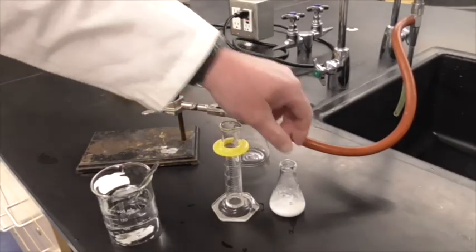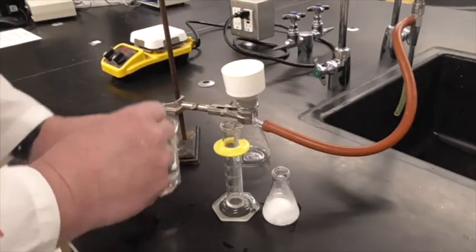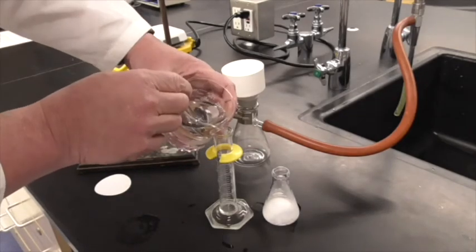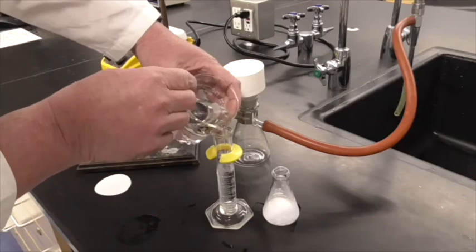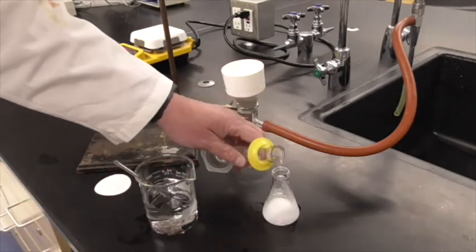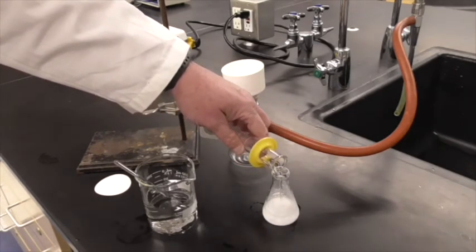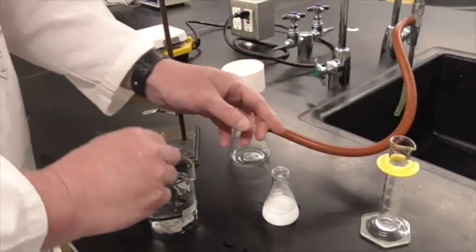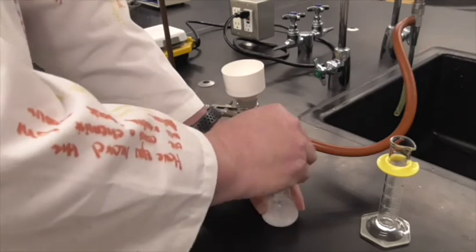Okay, so now we've got our aspirin, and it tells us to add 20 milliliters of water. I've chilled the water in the ice bath, so it's cold. So I'm going to add 20 milliliters of that to this graduated cylinder, and then I'm going to add that to our aspirin precipitate. And what that's going to do is just give us a chance to break up the aspirin a little bit. Aspirin is not very soluble in water at all, so we shouldn't see much of that dissolving.